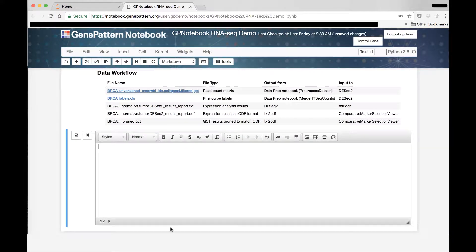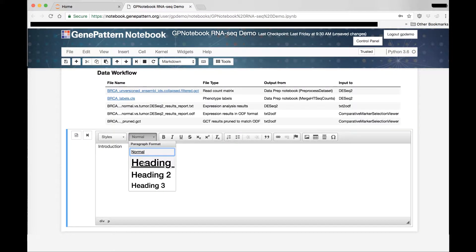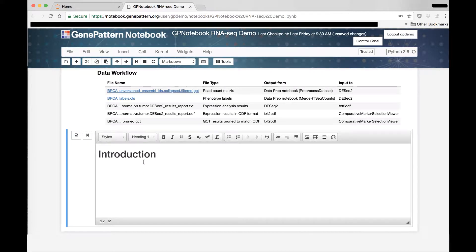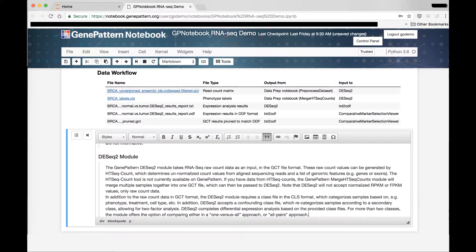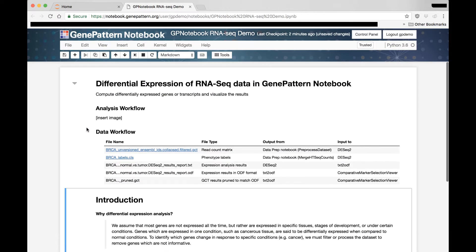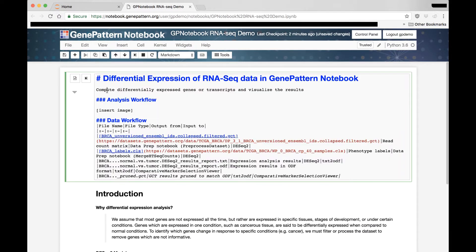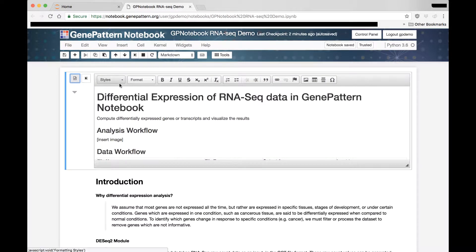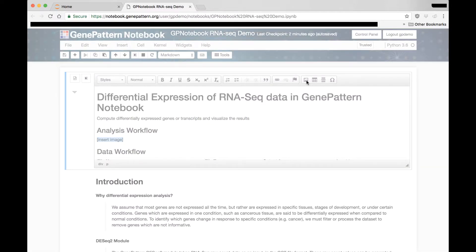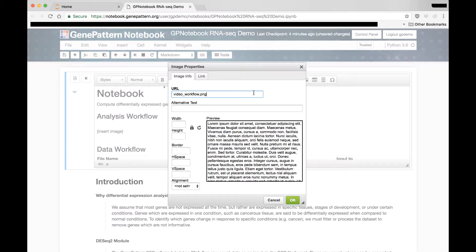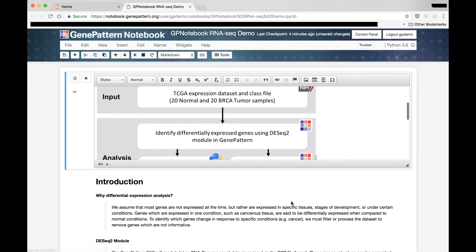Using this editor, we can also add in another title and format that as heading 1, then a description, which we will leave as normal text. Additionally, the Rich Text editor can import local images, like this analysis workflow, and easily format table data.